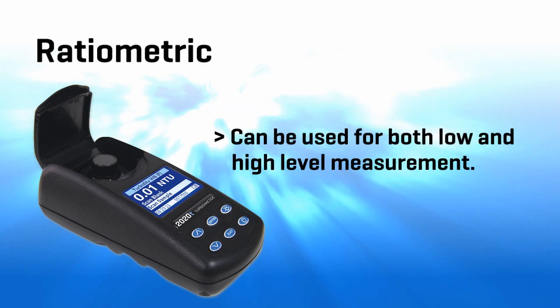If you're really interested in drinking water, you're interested in very, very low levels of turbidity. Natural waters, you're probably going to be interested in higher levels because it's not as treated.